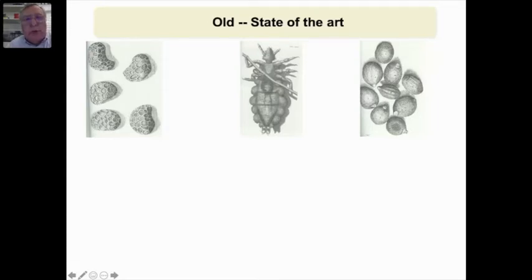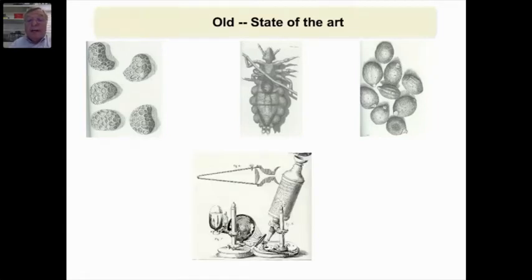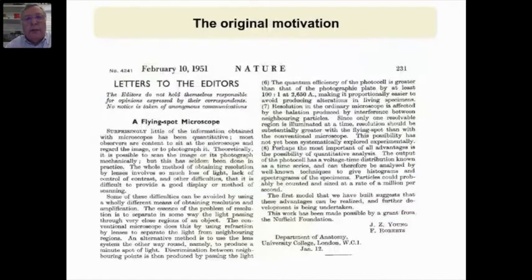And so the issue is, which instrument took these images? And the answer is this one. And these images were, of course, recorded by Robert Hooke in 1665 or thereabouts. Now, fairly clearly, this is not what he saw, but he was able to reconstruct from what he saw these really rather impressive images. So how did we get interested in Oxford?